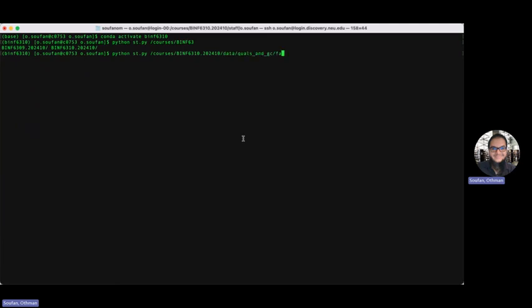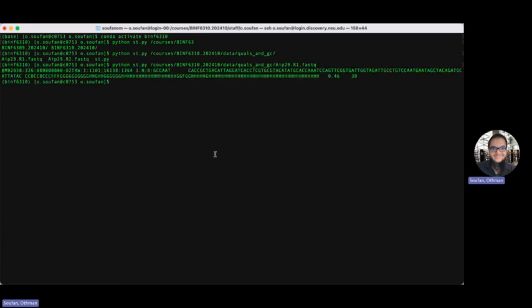And then what files do I have? Okay, it starts with apes, and here you go. I give it this file, I get this output, and you get these numbers. For the first read, it gives us the quality and the GC content. So, quality score and the GC content.